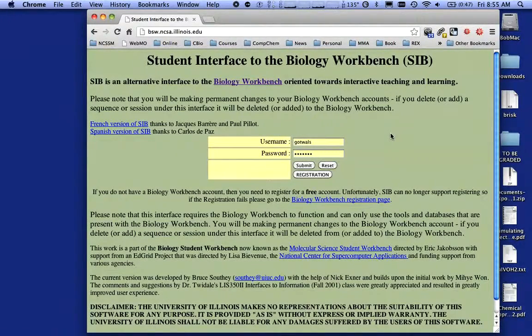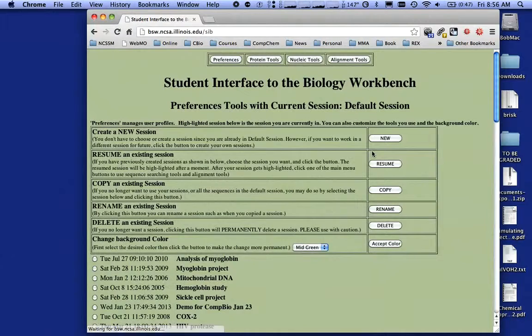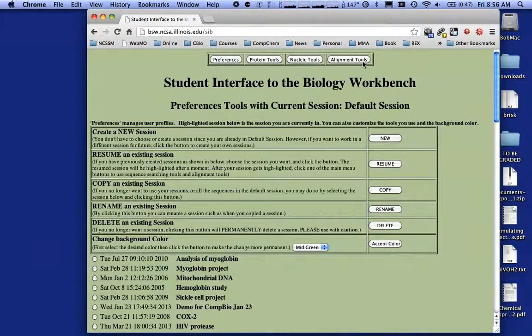Hello, this is a short podcast on how to use the student interface of the Biology Workbench. What you see on the screen here is the online screen. If you haven't registered, you need to click on registration and fill in that form. I already have a username and a password, so I'm going to go ahead and submit and get into the tool. At the top you can see four different toolkits — I'm in the preferences one right now.